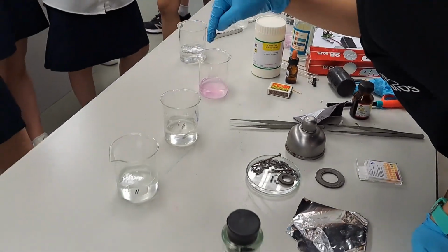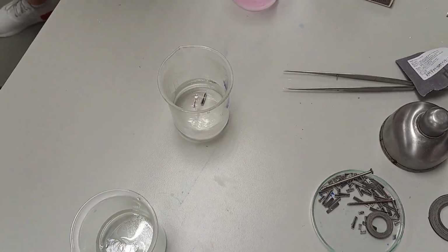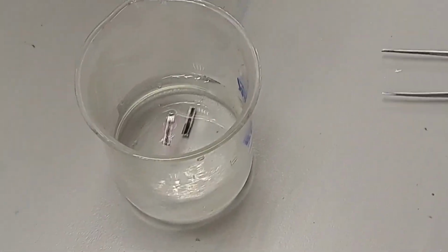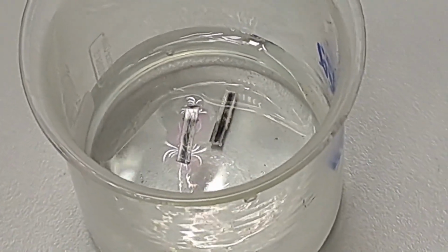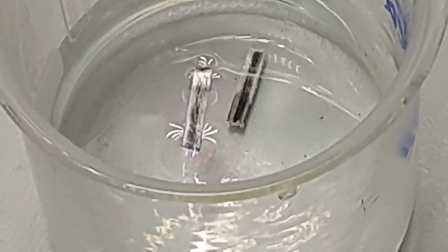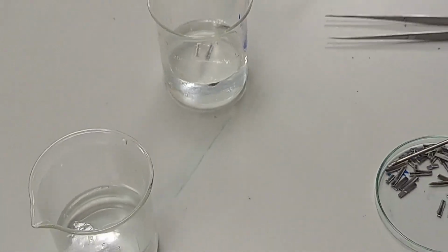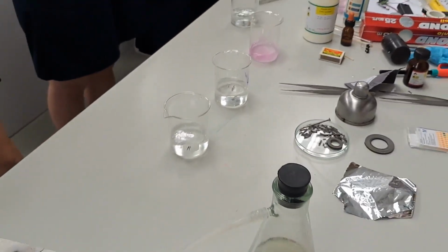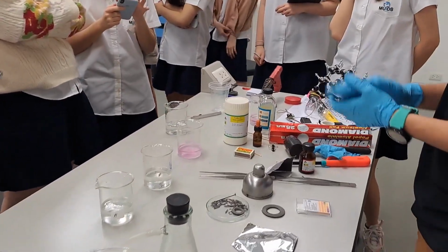Okay, guys, come take a look at magnesium. There is some pink around it. What is the water? Tap water and phenolphthalein, which is a pH indicator. Pink is base; neutral and acid are clear. Do you know base, acid, neutral? Okay, all right.